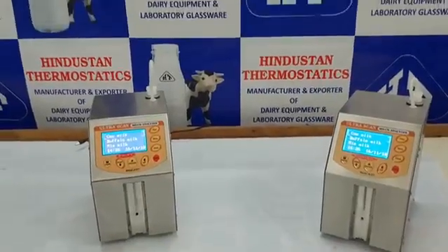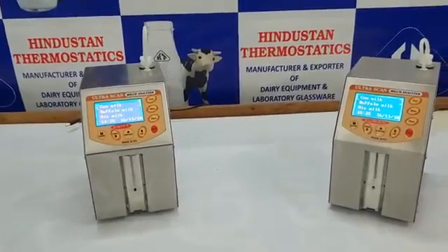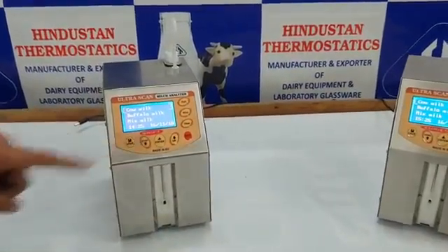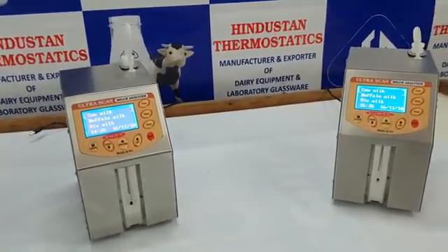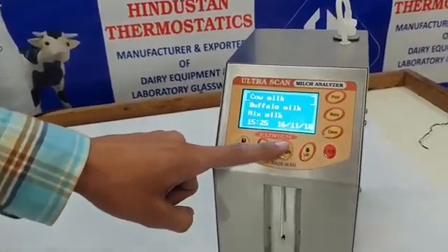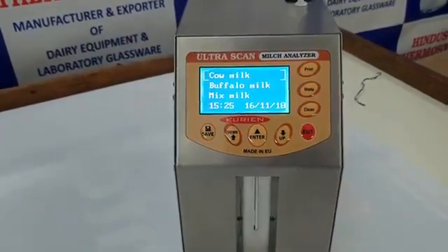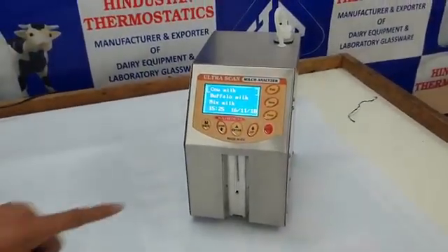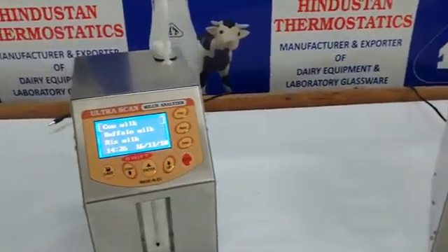Hindustan Thermostatics introduces two types of milk analyzer. One is the Ultrascan Swift, a double sensor machine which gives results in just 18 seconds. The other is a single sensor machine dedicated to the milkman of India, Mr. Verghese Kurien, which gives results in 30 seconds — named the Ultrascan Kurien.